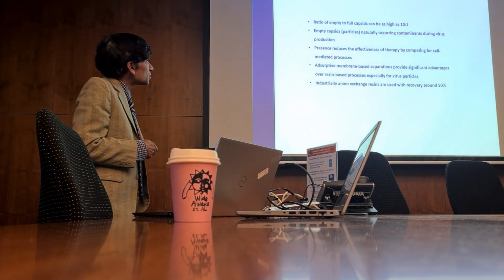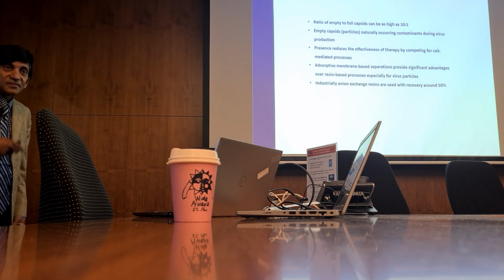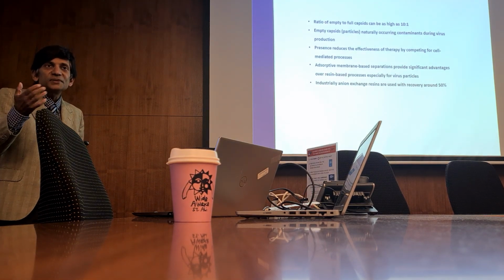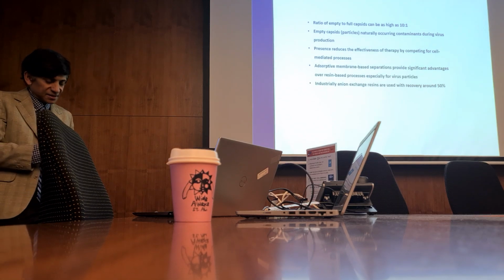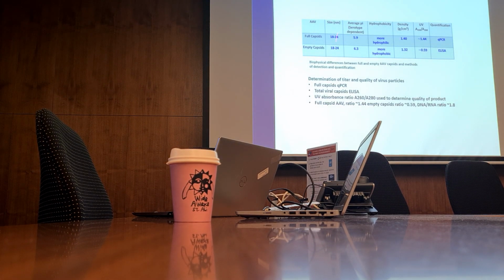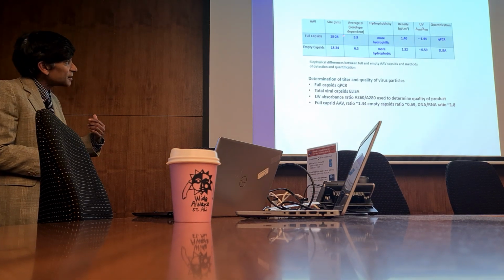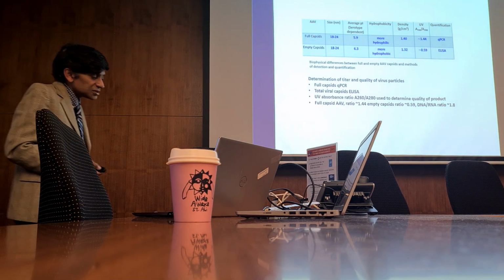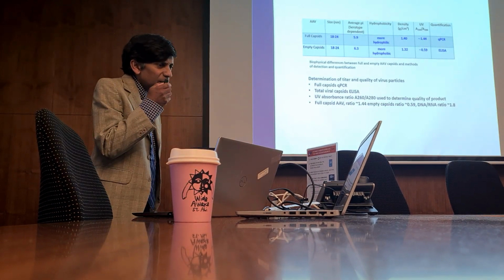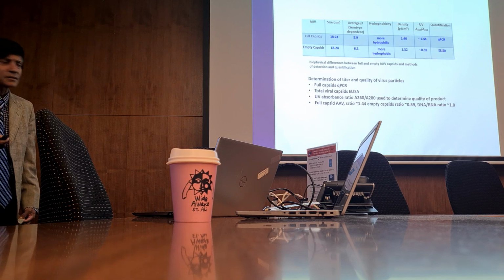So our idea was to look at whether we could use adsorptive membranes for this separation. Many of you know adsorptive membranes are good because they overcome poor diffusional resistances, so this could be an ideal application. But the challenge is this, and I'm really just going to talk about the challenge. Filled capsids, this is for AAV. Adeno-associated virus is probably the leading candidate for gene therapy applications today, that and lentivirus.